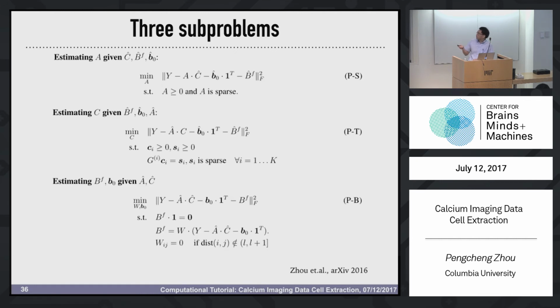And regarding the computational complexity, all these scale linearly with the number of pixels and the number of frames.